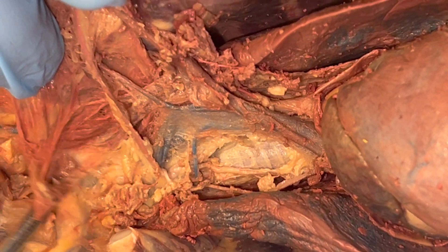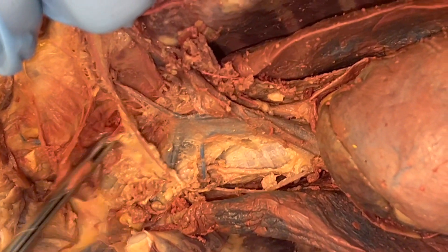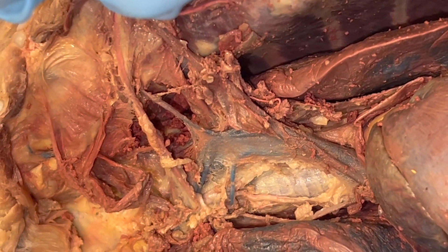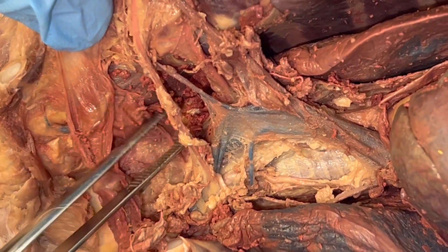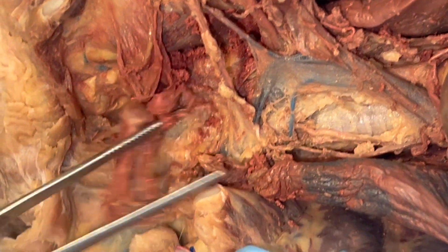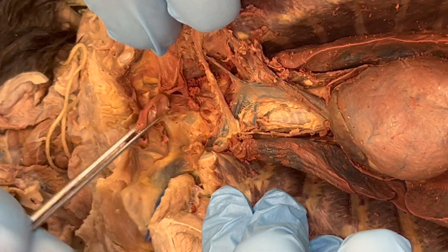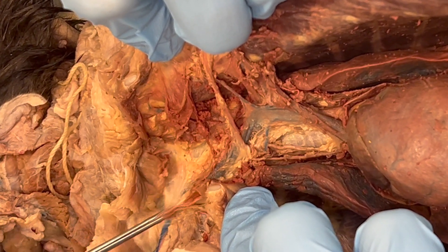You want to dissect a little bit further with the scalpel blade through those upper ribs and follow the blue — follow the branching blue. It will eventually split into a big left and right, and you can see it going down the right side of this cat. You want to follow it into the arms.